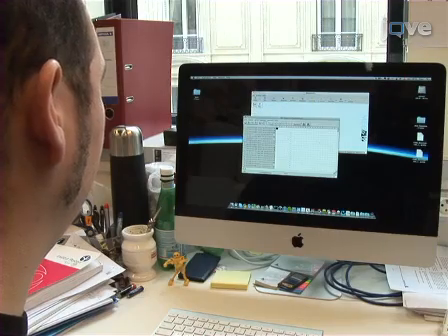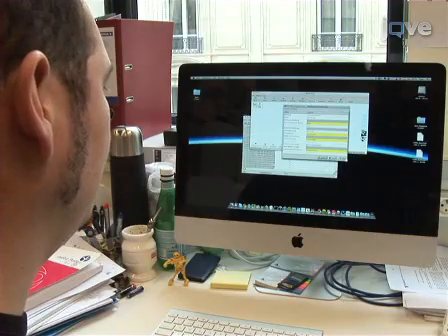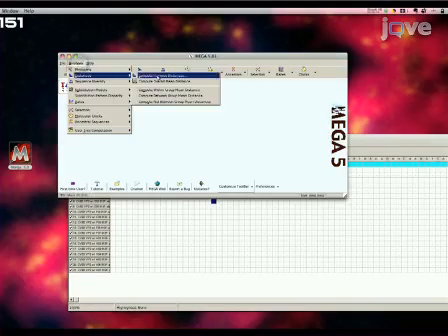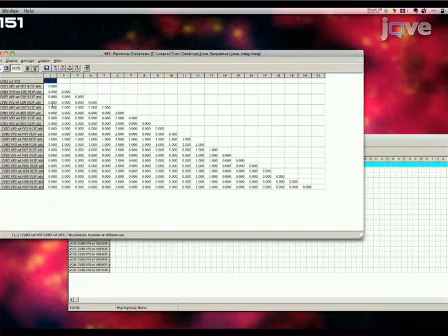As an option, use the edited sequences to calculate all possible pairwise comparisons within a sample to obtain mean values of population diversity. Several alignment programs are available. Here, Molecular Evolutionary Genetics Analysis Program, also called MEGA, is used.